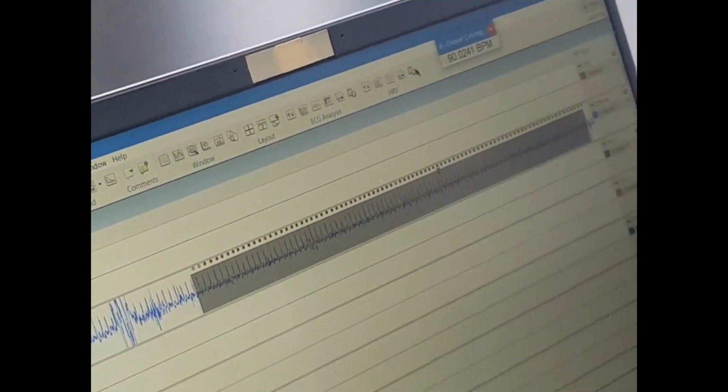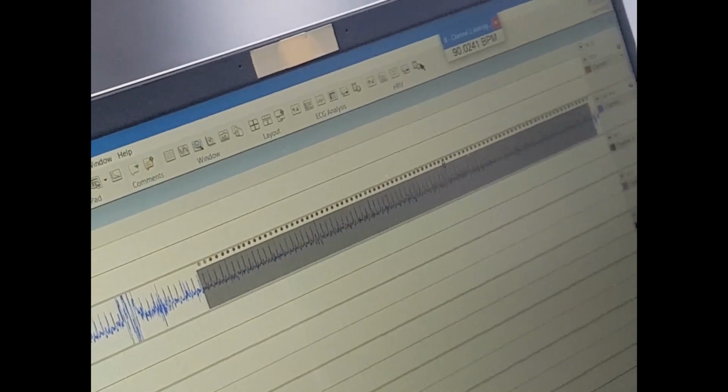So should we fix it if we had another accident like we just did, and make it so that there's a dot or a circle above every beat, or is it okay to ignore one of them? No, we cannot ignore. We can't consider that one an artifact? The program itself will have certain safeguards, yes. But we try to get the whole data.